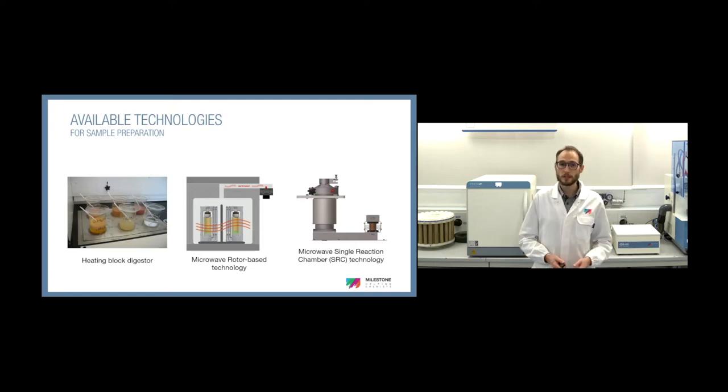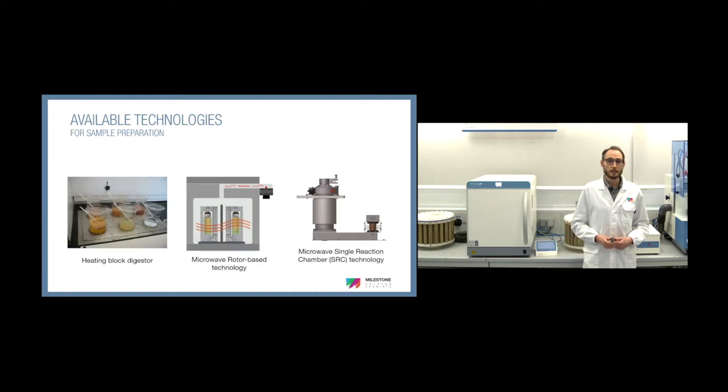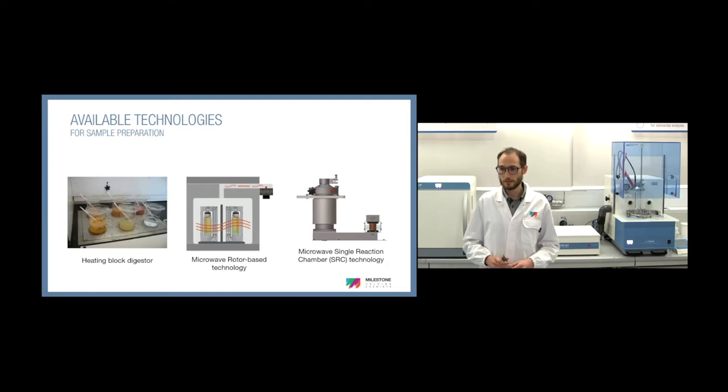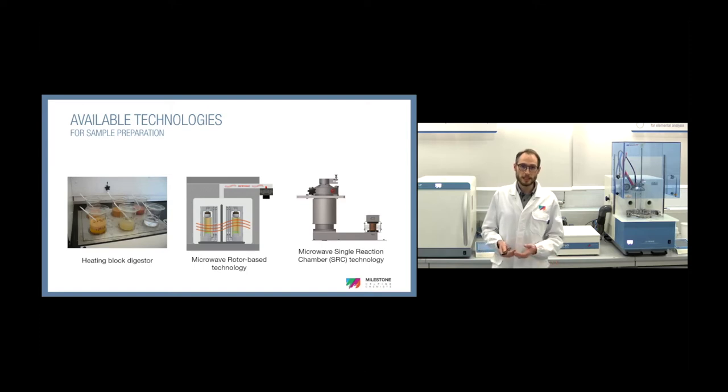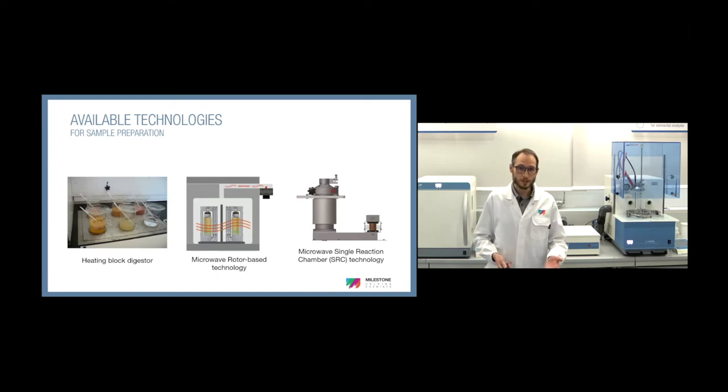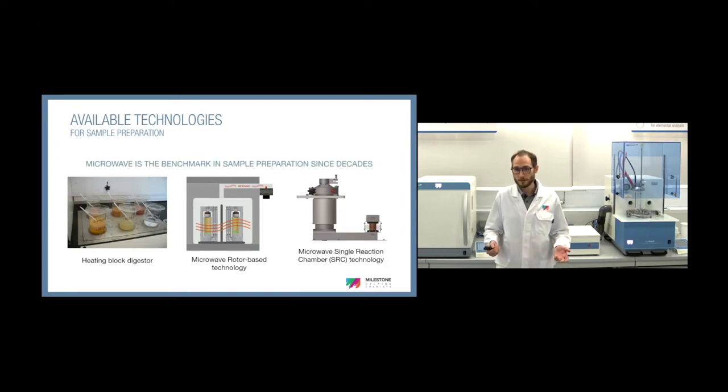On the other side, we have the microwave systems, and microwave systems can be rotor based, like the one that you see here, or a microwave single reaction chamber. Later, I will give you some information and explain the difference between these technologies. But if we consider heating block digestors and microwave systems, nowadays the most common technique used to digest a sample is the microwave. This was also confirmed by your answers to the questions during the registrations, where we have seen that most of you already use a microwave system to prepare the sample in the lab.